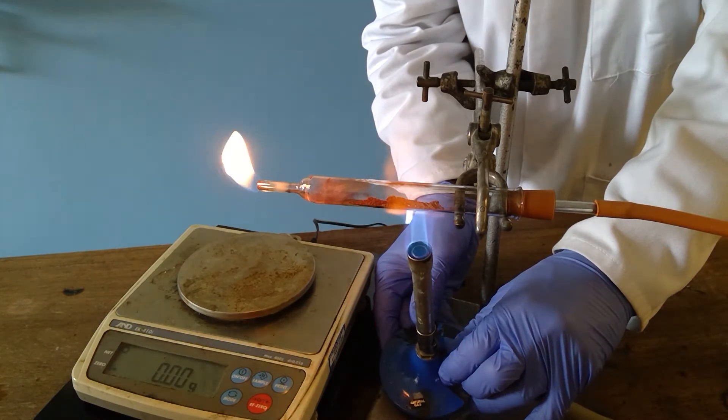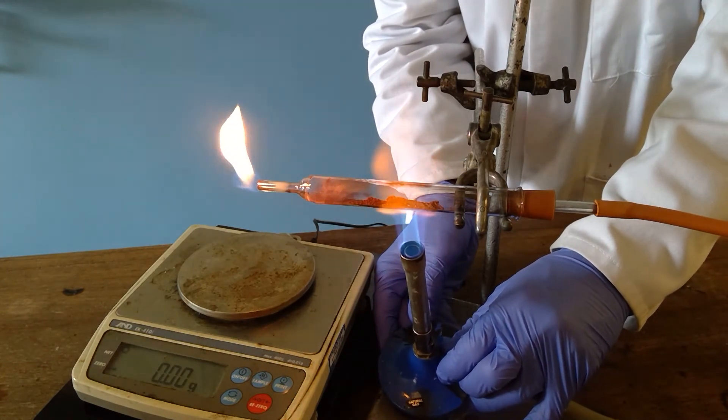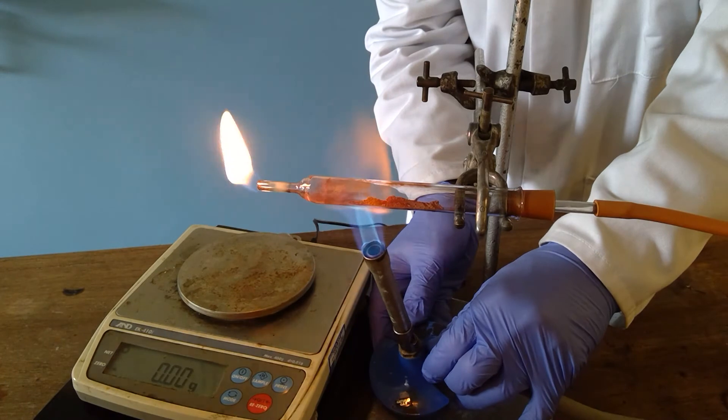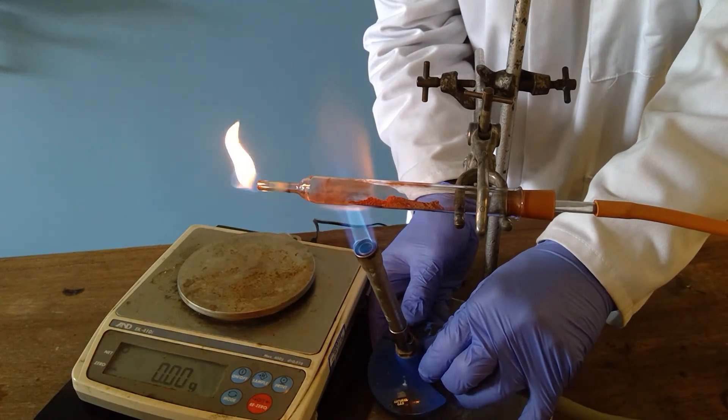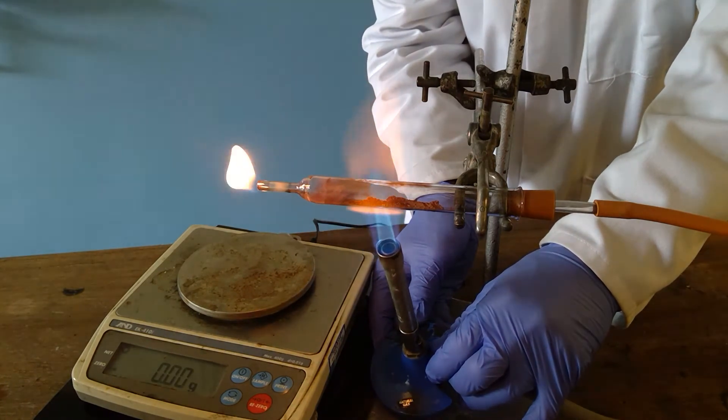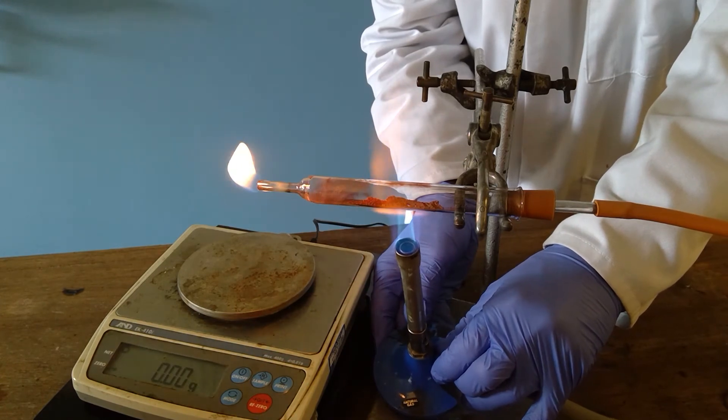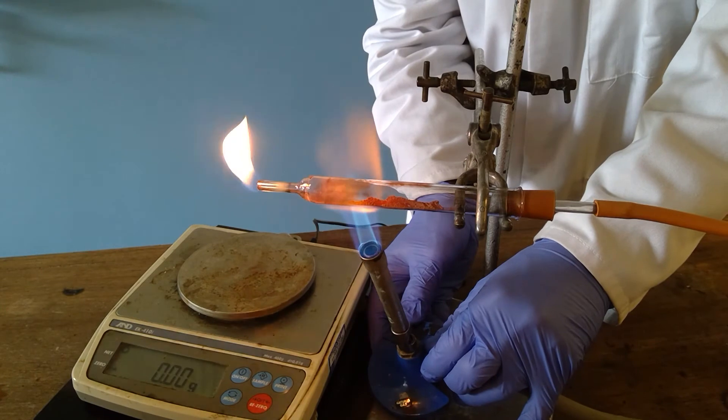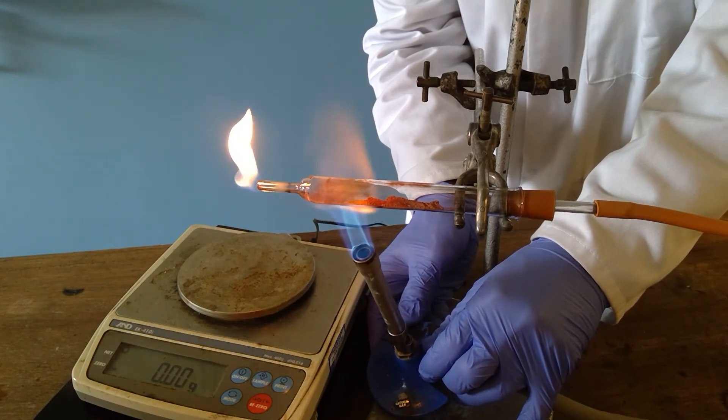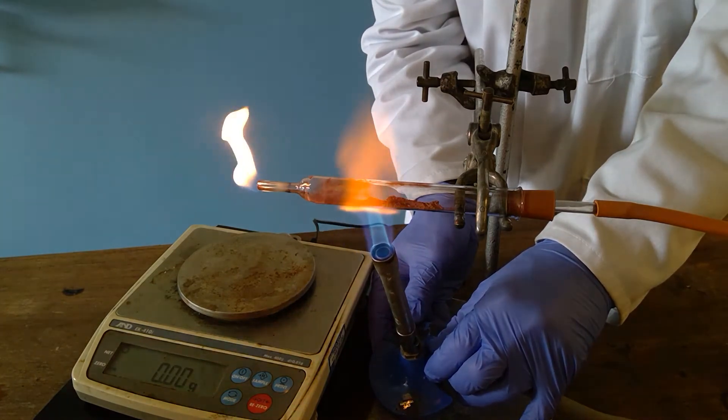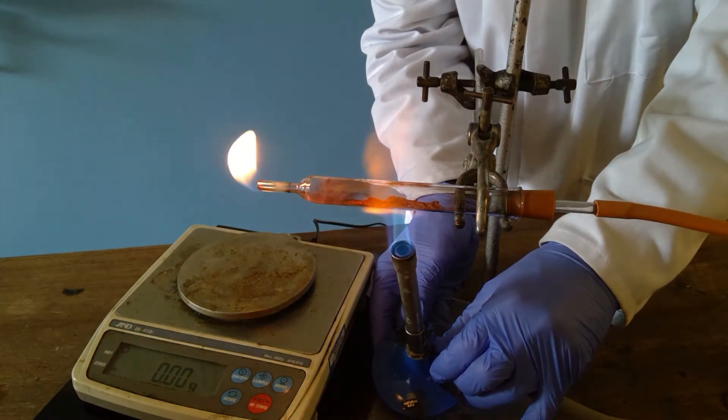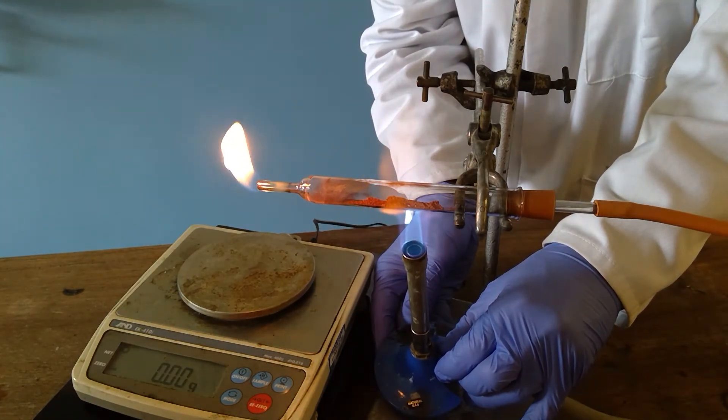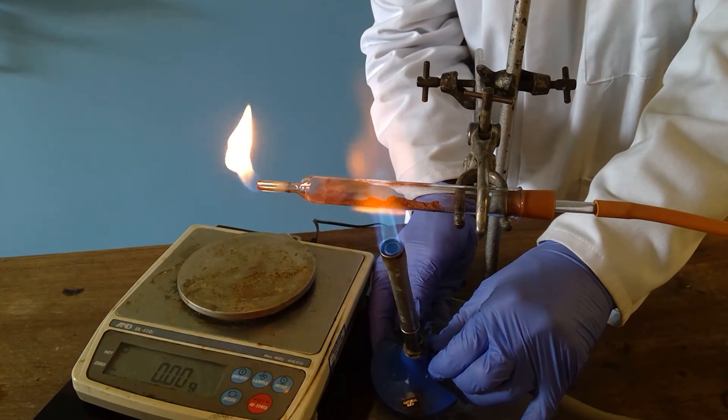To ensure that we have done this we would, after the first weighing, which we would do in a second of the copper and the combustion tube, we would put it back onto this equipment and we would heat again. If, after further heating, it has the same mass we can be fairly certain that we have driven off all of the oxygen. This is called heating to constant mass.